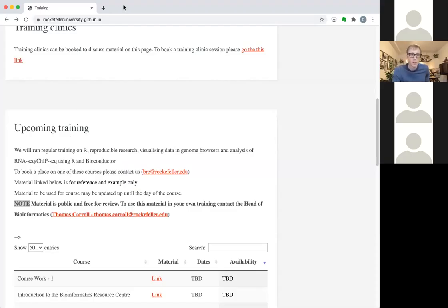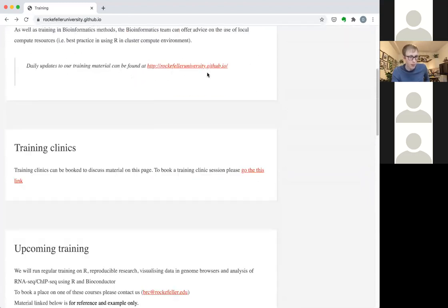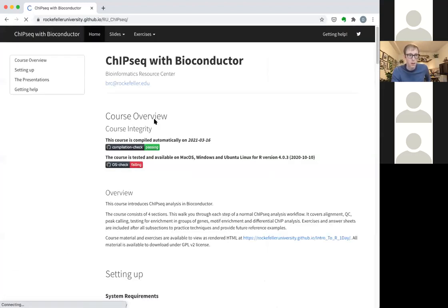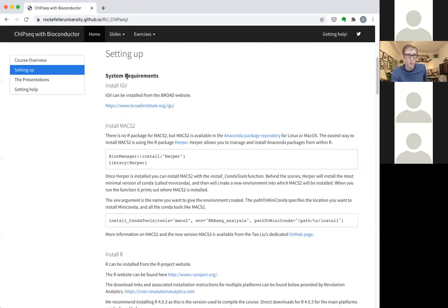So let's pull up our normal training page, the same page you guys have been accessing throughout the entire course. As usual, we'll click on the relevant course. Hopefully you guys have obviously installed a lot of this stuff, IGV.